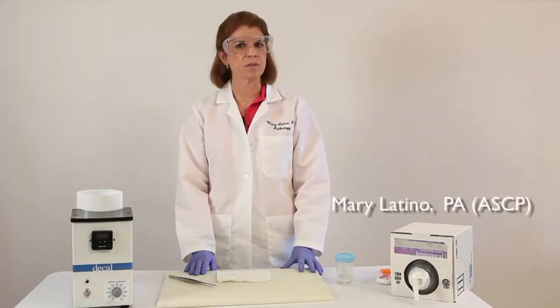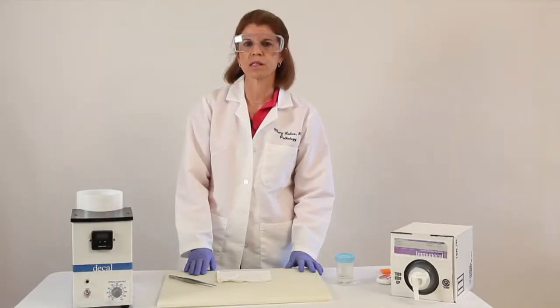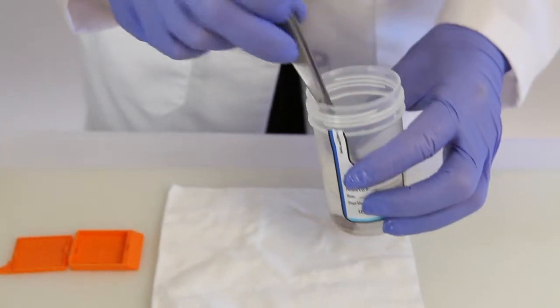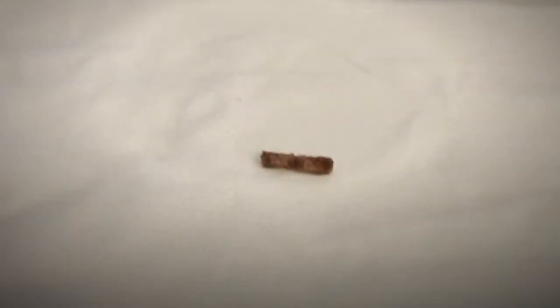I'm Mary Latino here with some tips for decalcifying a bone core specimen. As you can see they're typically cylindrically shaped like this one because they're taken from bone marrow using a needle.